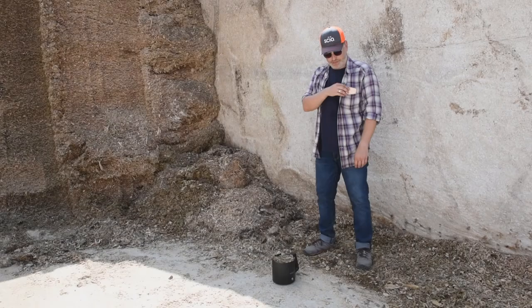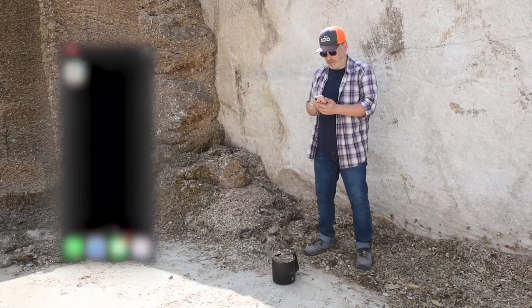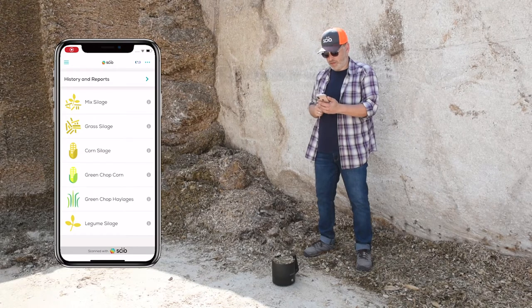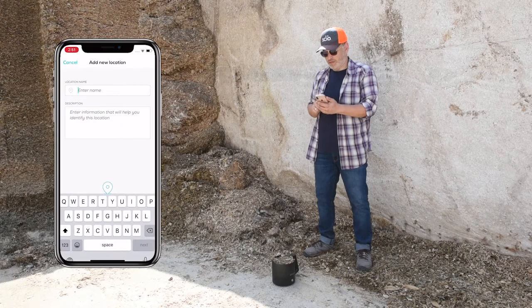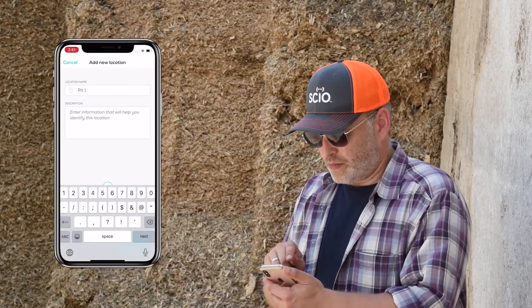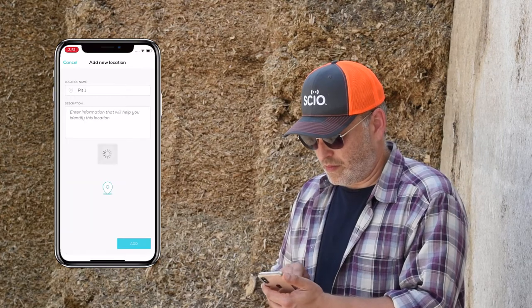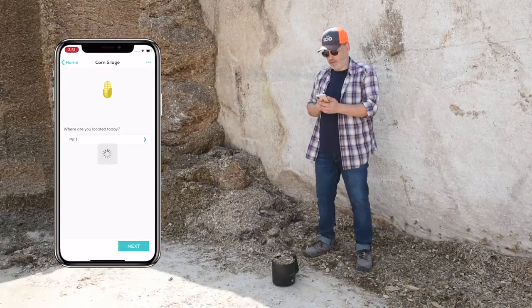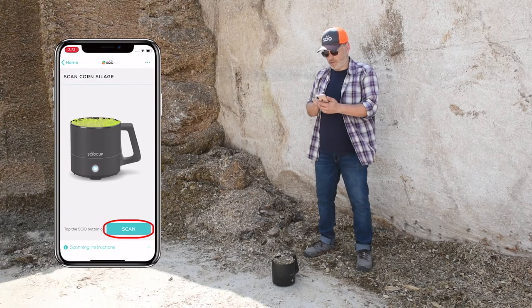We're now ready to measure dry matter. Launch the app and select the silage type. Siocup supports a large variety of forage types. In this case we're measuring dry matter in fermented corn silage. If it's the first time measuring silage from this silage pit, enter its name. Next time you measure silage from this pit, simply select it. Click the button on the cup or tap the scan button in the app.